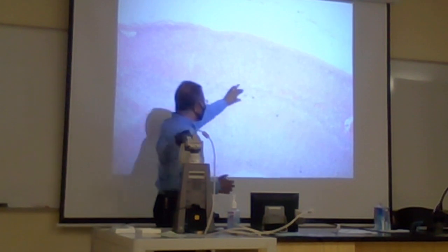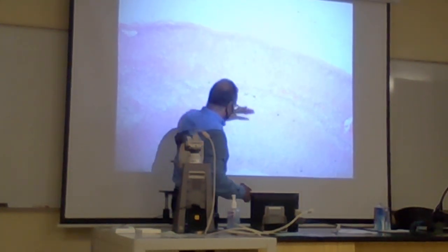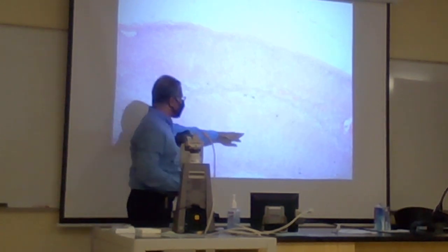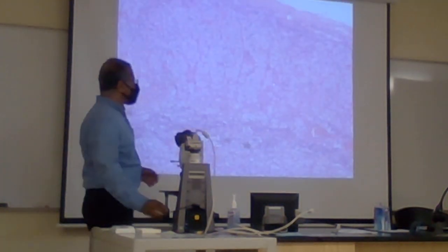This is the medulla in the middle, and this is the area we are interested in. Similarly, this area here is the cortex, below and above it. So we will zoom into that area.